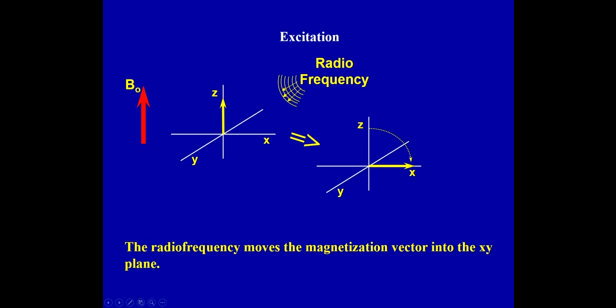When you have a magnetic field, even if it's small, like the one generated from the coherence of all these spins in the sample, when you have a net magnetization precessing near a conductor, that magnetic field, it's a changing magnetic field that oscillates over time as it spins around, that generates an electric current in the conductor, and that's what we detect. So the pulse-acquire experiment consists of taking the net magnetization and rotating it into the XY plane to some extent so that we can detect a signal.